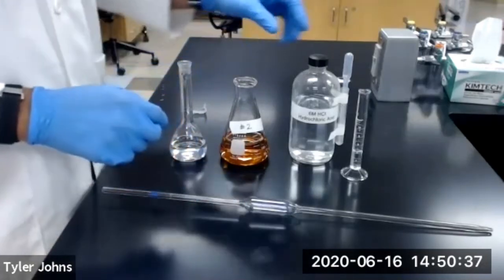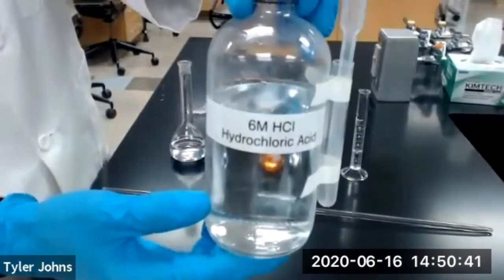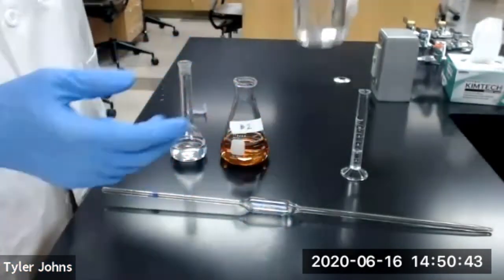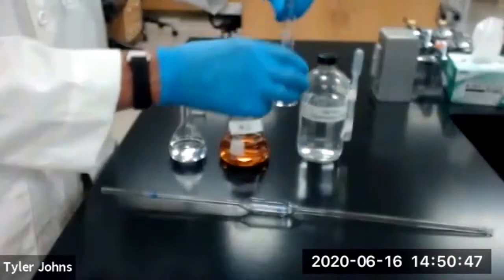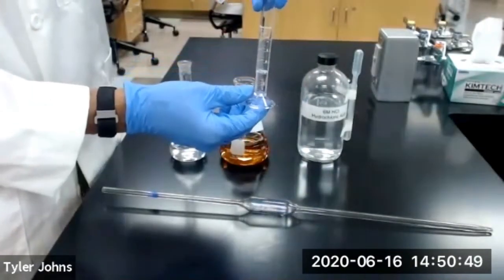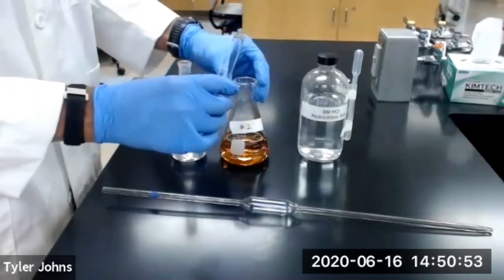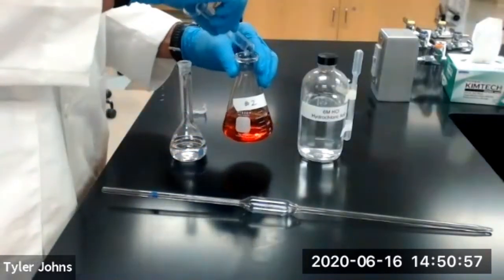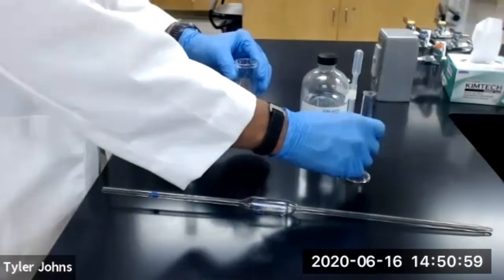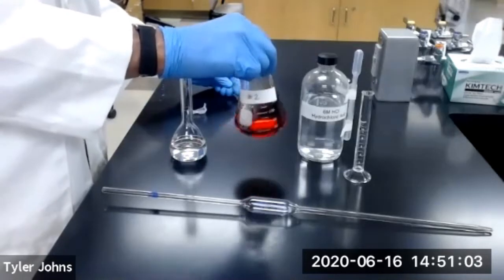We will also add 4 milliliters of our 6 molar hydrochloric acid to Erlenmeyer flask number 2. And I've already measured out the 4 milliliters of hydrochloric acid using a 10 milliliter graduated cylinder. We'll add this to Erlenmeyer flask number 2. And then we will gently swirl the flask to mix.